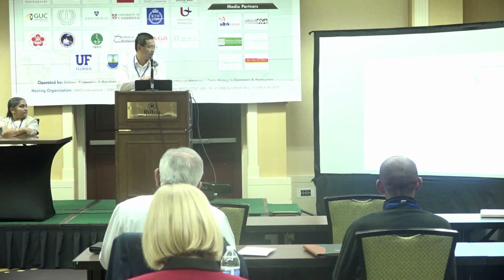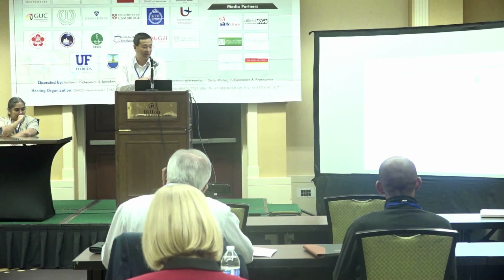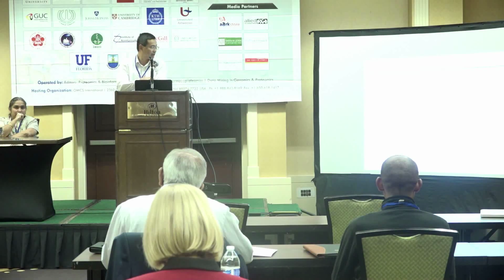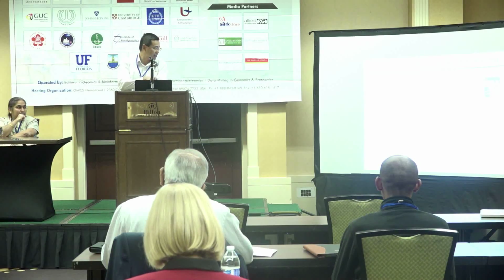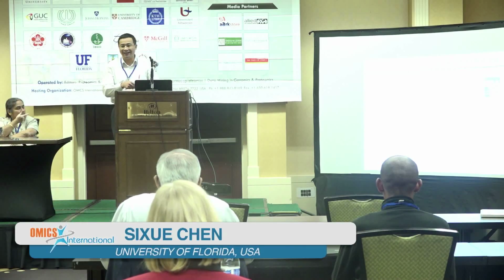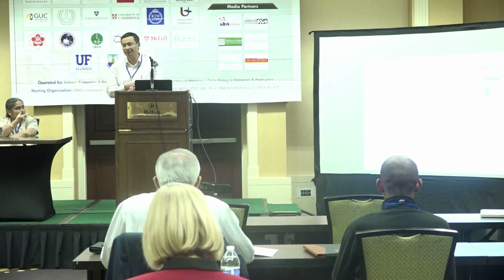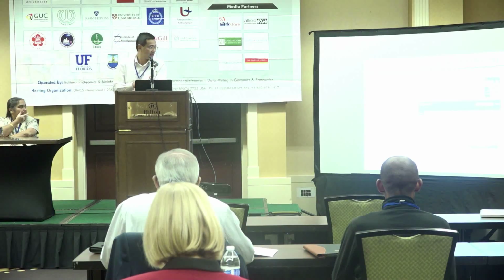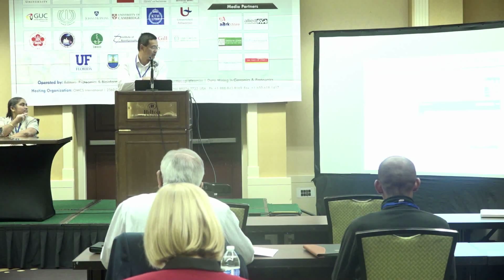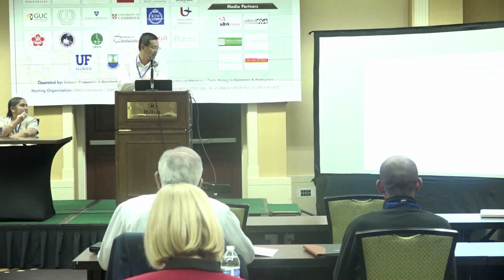There are many ways to do this. In our lab, we have enrichment for phosphopeptides. After enrichment, we see mostly phosphorylation. Without enrichment, we don't see phosphorylation. Data sharing, data standardization: HUPO, the Human Proteome Organization, is the leading organization defining the proteomics standards. Nowadays, if you want to publish in many journals, you have to deposit your data into a common data repository, like ProteomeXchange. That's the one we put a lot of data on for publication.